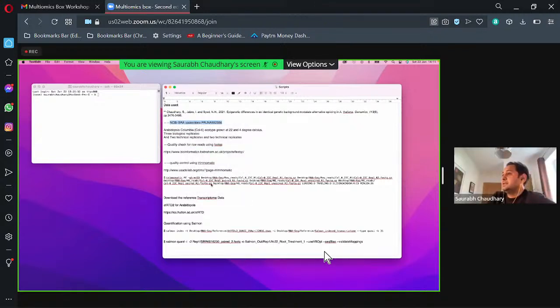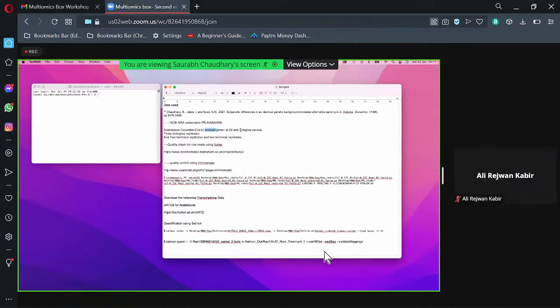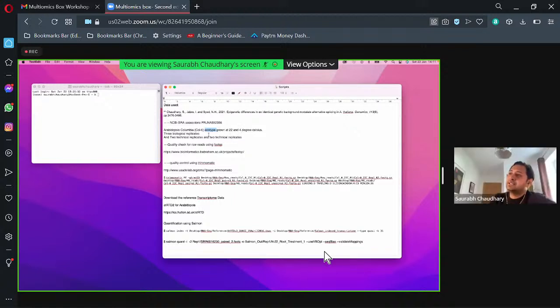Under this study, there is a number of datasets available, but I'm going to use only the Arabidopsis Columbia ecotype data, which is grown at 22 degrees, and we provide a 4-degree treatment as well. So there are two conditions. One is control, which is 22 degrees, and there are stress samples as well, at 4 degrees. We generated the RNA-seq data for this Columbia line, which is a wild type of Arabidopsis, under the conditions of 22 degrees Celsius and 4 degrees Celsius.